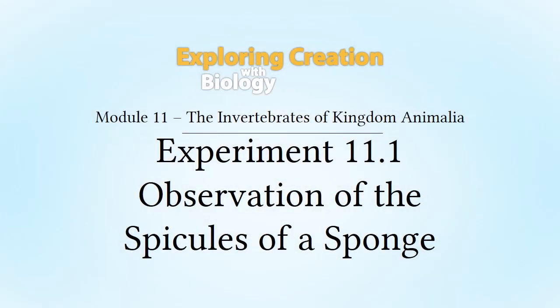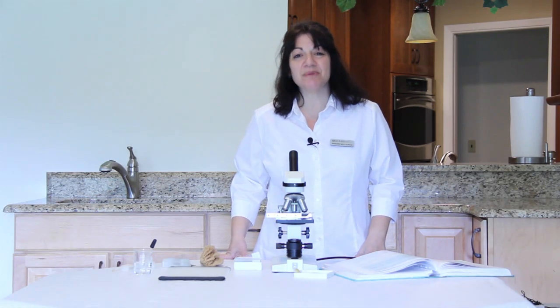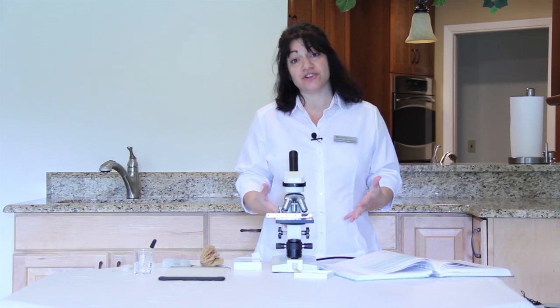Module 11, Experiment 11.1, Observation of the spicules of a sponge. In this lab, we're going to take a closer look at sponge spicules. This will give you a better idea of the support structure of sponges.